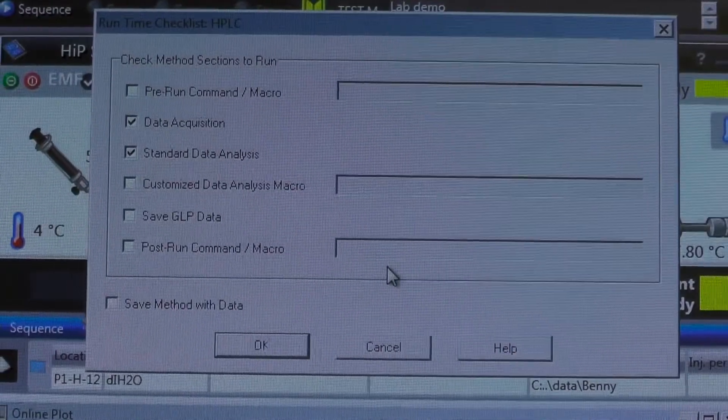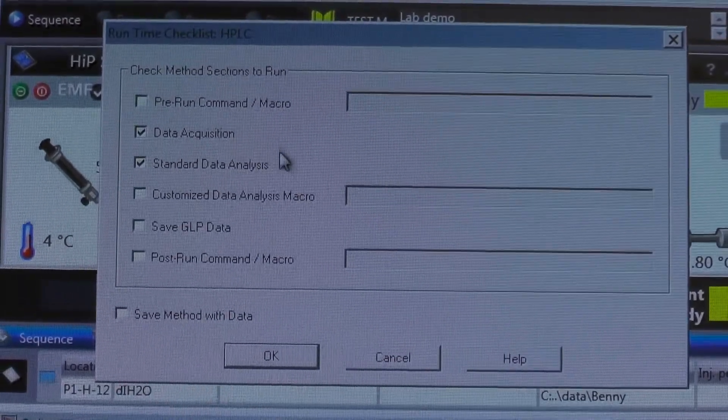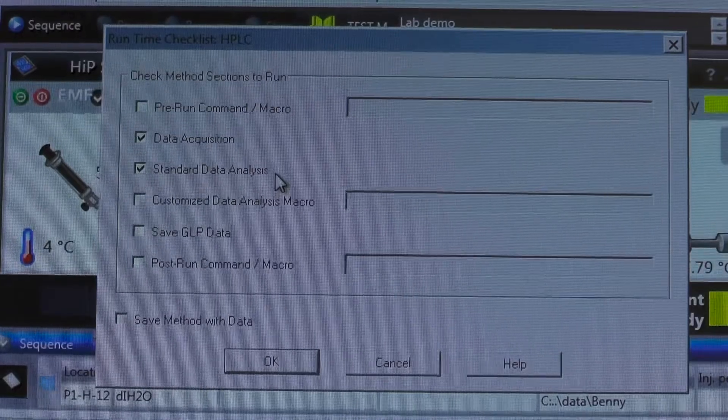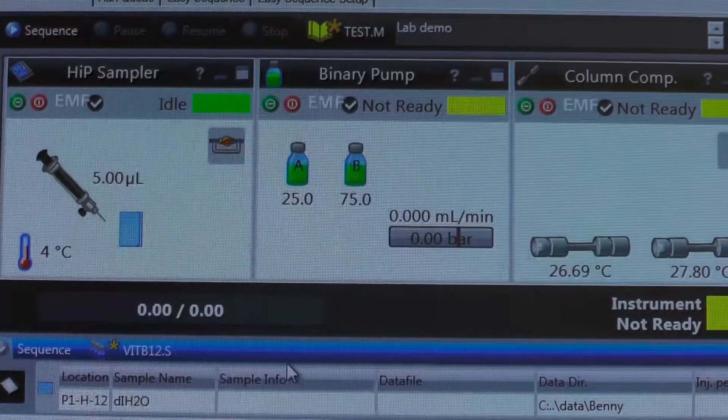Finally, a Runtime Checklist will pop up. Data Acquisition and Standard Data Analysis are usually selected. Click OK.